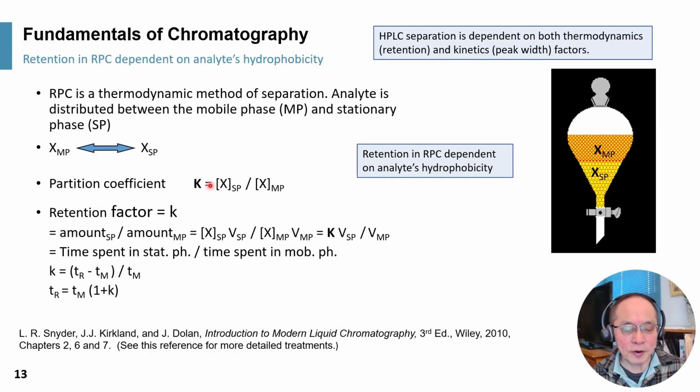So the K would be very big, right? And there are some correlations which can show you the similarity that can be derived in matching K prime with K, the big partition coefficient.